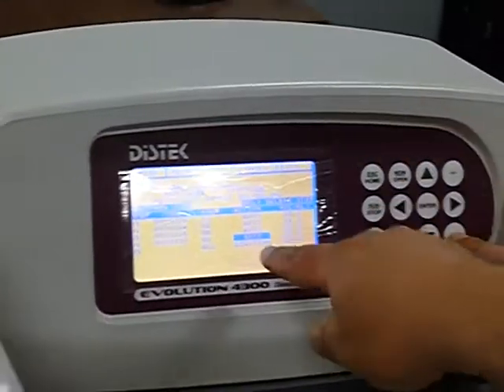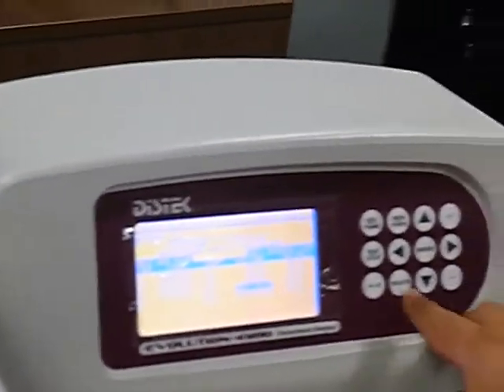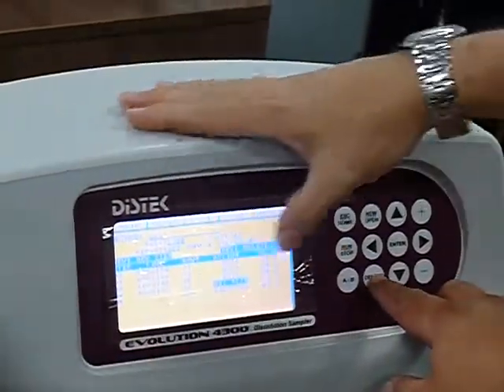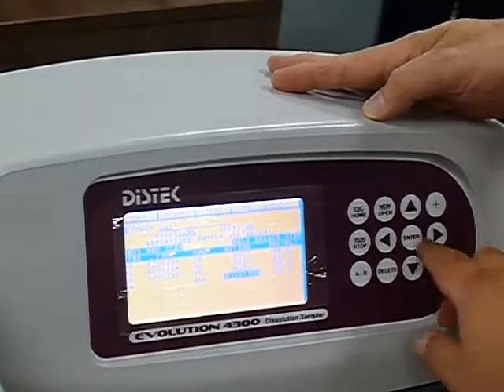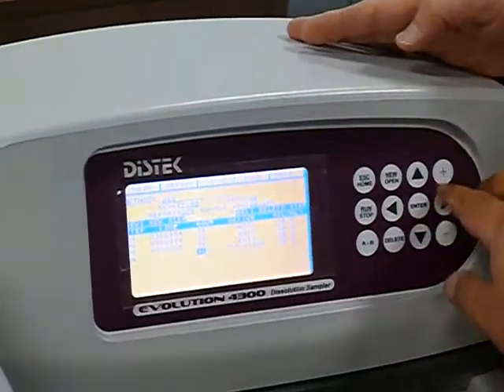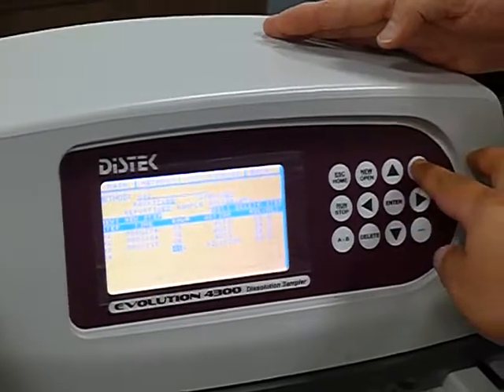And then the next one. Its steps are in here, so this is a bit funny. You've changed step 5 before you changed step 4. And now you've got to get rid of all. So you want to go over there now and arrow to be row 3. This should be row 3.